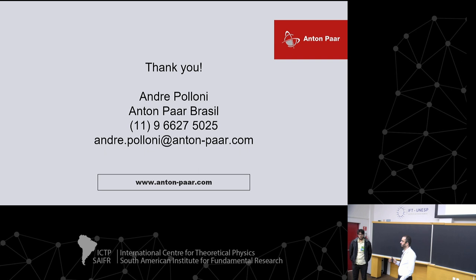And can it work for polymeric film, porous polymeric film? Yes, porous polymeric films. You can use the same sample holder. You just need to make a coil, for example, with the thin film. The important thing is to have a representative amount of sample. It's not a problem to determine the size of pores in membranes or thin films, for example, and the porosity as well. It's kind of easy.